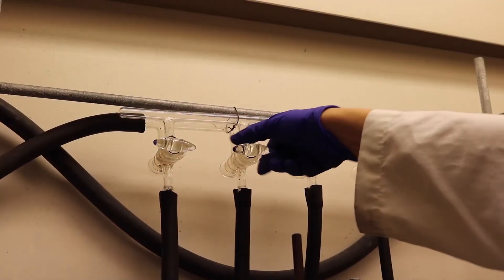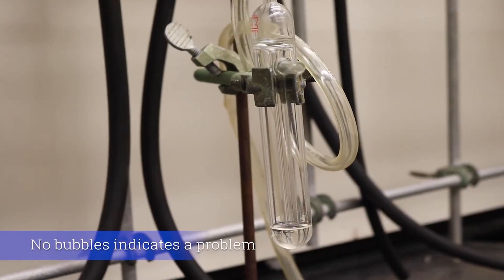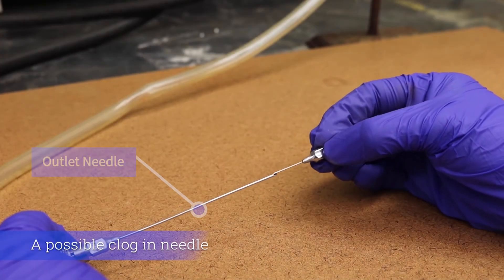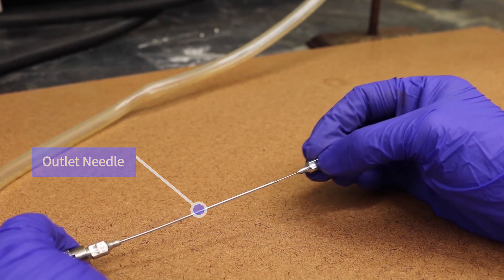Turn the knob in the manifold vertically to let the argon gas in. Bubbling should occur in the second bubbler immediately afterward, indicating that the argon gas is flowing through the round bottom flask. If bubbling does not occur, report to your instructor — the outlet needle may be clogged or there may be a leak in the manifold tubing. In order to unclog the outlet needle, place a smaller needle inside and move it back and forth.